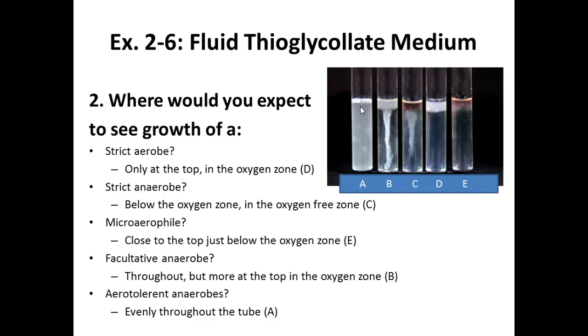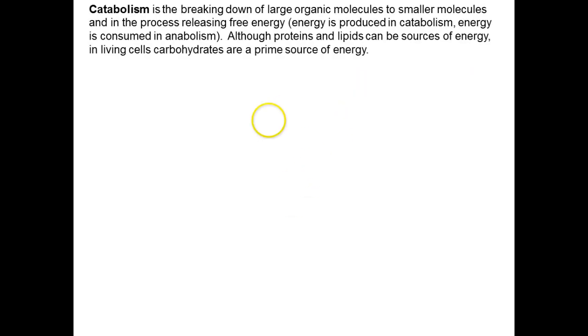We may or may not have aerotolerant organisms, right? Most of you guys have facultative, right? So why do we see differences in growth? It has to do with, as I said, what they're using for energy.